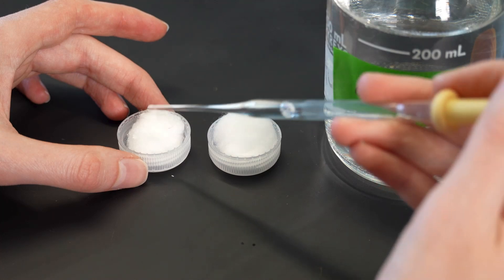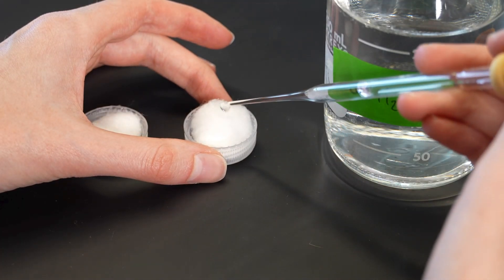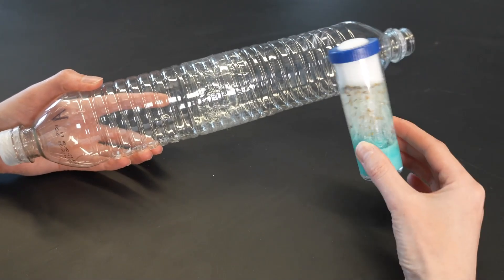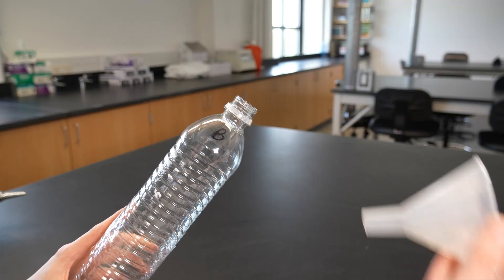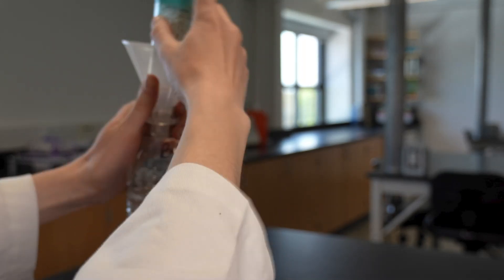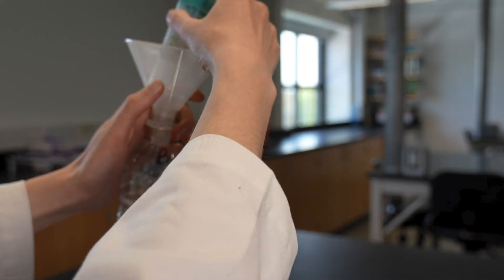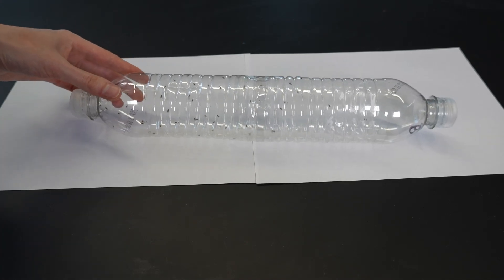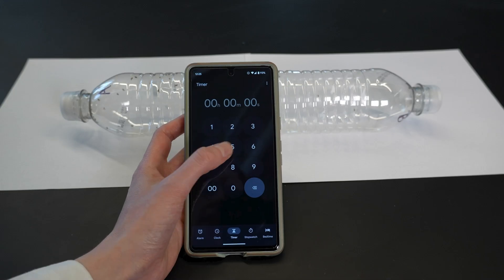The first thing we'll need to do is collect control data using distilled water. I'm going to add a few drops of distilled water to each cotton ball, but you do not want to soak the cotton balls — you can actually drown your flies if there's too much moisture in there. I'll put a cap back on one bottle, then transfer my flies from the culture vial into the choice chamber. I'll put my funnel in the open bottle, tap the vial of flies so they all fall to the bottom, quickly uncap the vial, flip it over onto the funnel, and tap again so the flies fall through the funnel into the choice chamber. I'll quickly put the second cap on so the flies don't escape, lay the chamber on a white piece of paper — this makes it easy to see the flies and gives a uniform background in case color is a stimulus — and set my timer for five minutes.